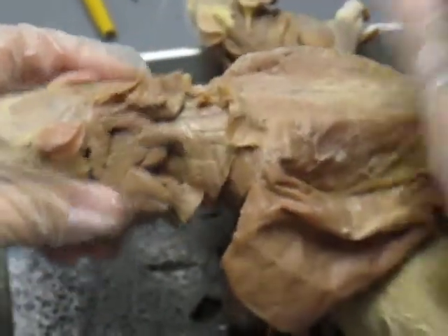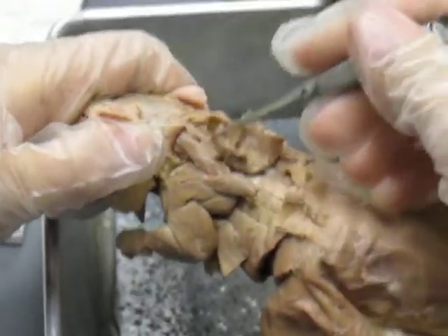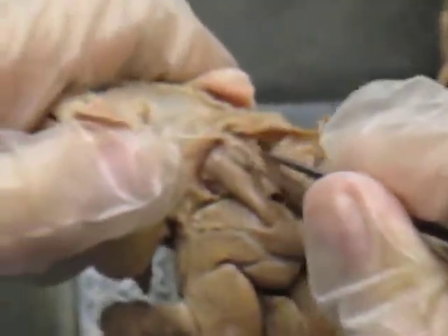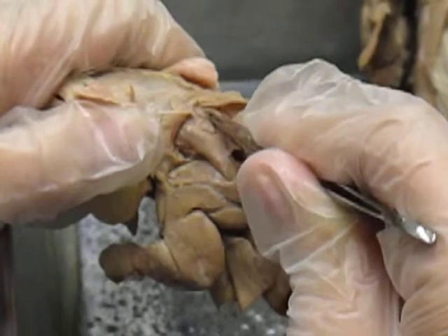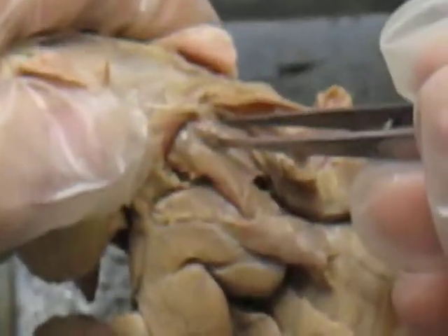Then we moved up to the shoulder. You have your cervical trapezius, that's cut and reflected. Here you have your rhomboideus, and your rhomboideus. And between and underneath your rhomboideus is your splenius, with a P.